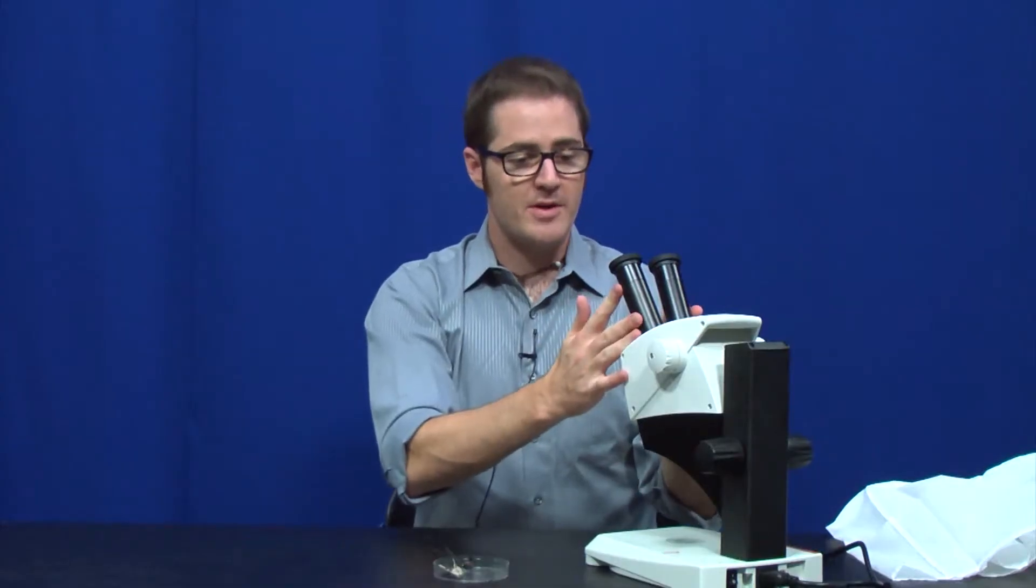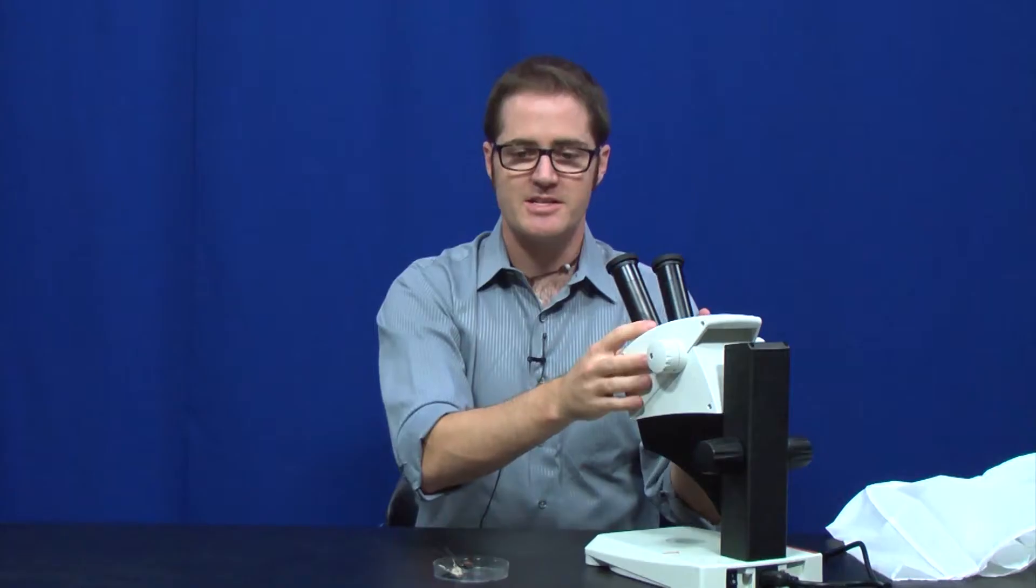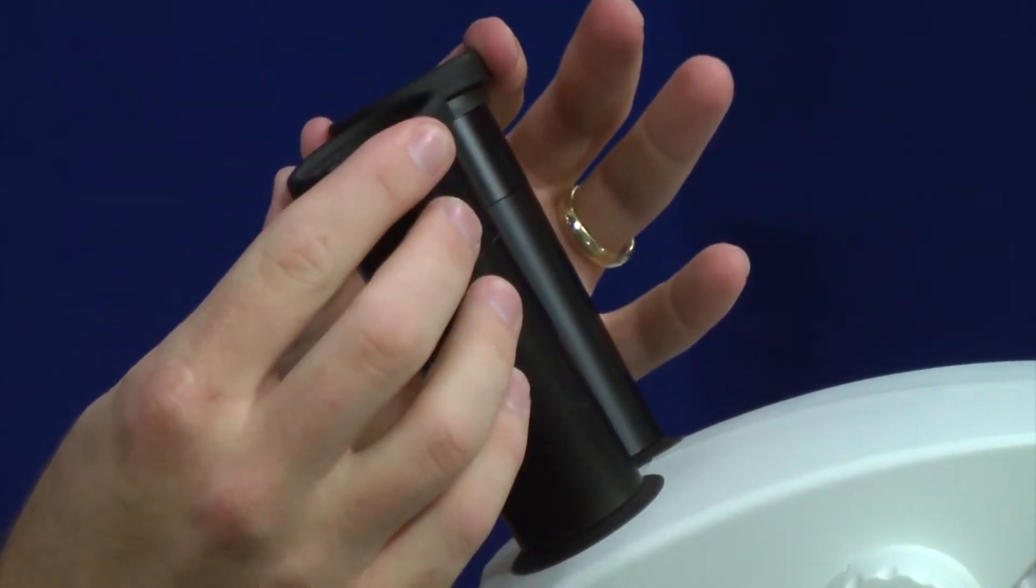The eyepieces do adjust width-wise because everybody has different sized heads, so we want to make sure we can comfortably see through the microscope. It does also have rubber eye cups on them. Right now I have them folded down.